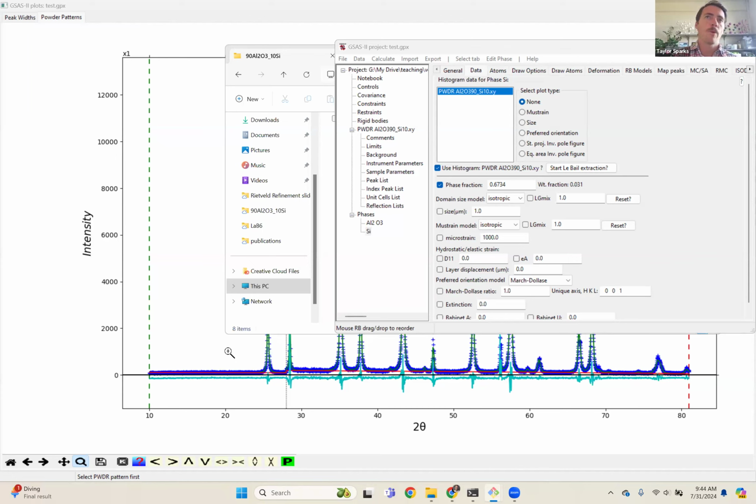They're just parameters in an equation that looks sort of like a peak. So they're not based in anything physical anyways. So I don't know what values would be unacceptable. I just allow them to refine to anything. Okay. And then he says, you're okay getting a negative value for W. Is that still okay? Yeah. I don't have a problem with that. These are good questions. Are there other questions I can answer before we move on?